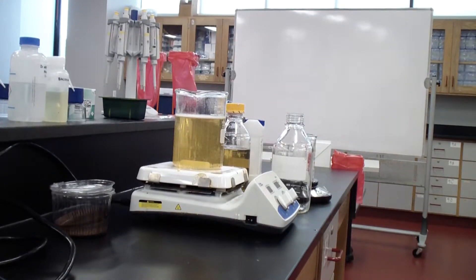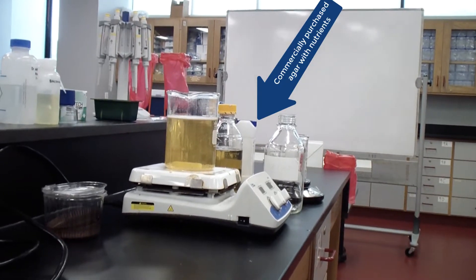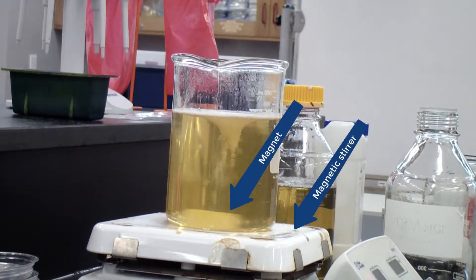To prepare agar plates, commercially purchased agar with nutrients is mixed with water and heated until boiling until the powder is completely dissolved. We use a magnet and a magnetic stirrer to mix the medium continuously.